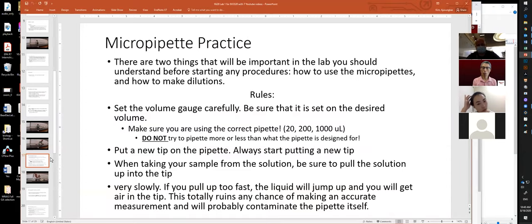But I'm telling you one more time, the main purpose of using these micropipetters, instead of the typical macro version of pipetters, is handling small, tiny volumes, micro units of volume. 1 micro means 10 to the power of -6, so it's really tiny. This course, Biology 320, Cellular and Molecular Biology, will use these micropipetters throughout the semester when you come to the in-person lab. So you have to know how to use these micropipetters.